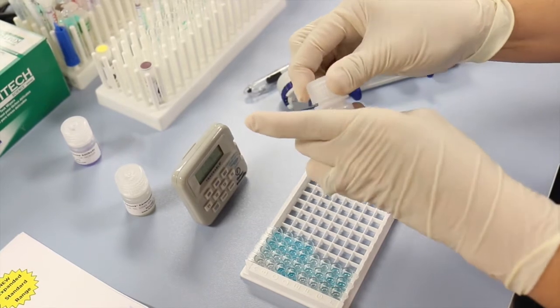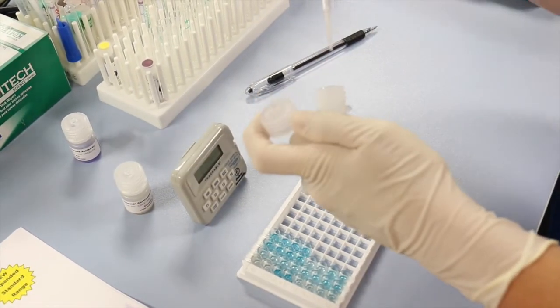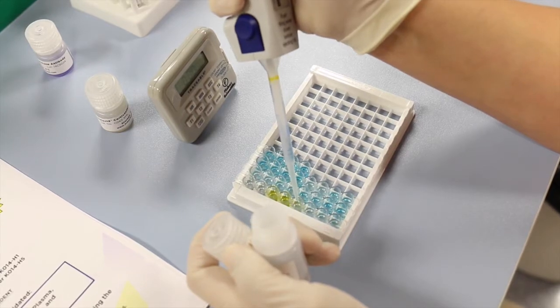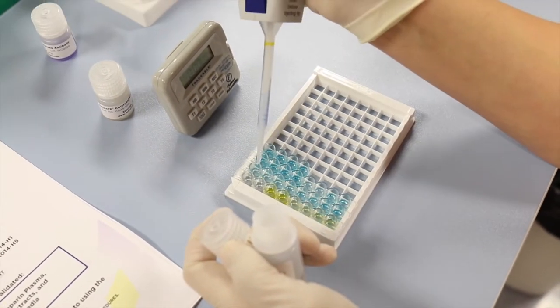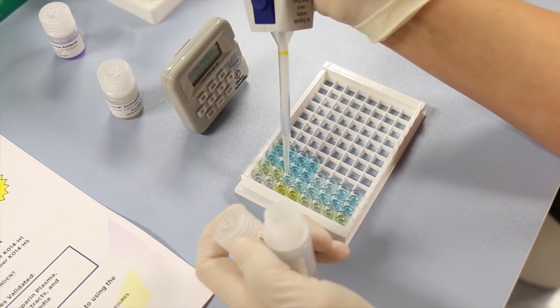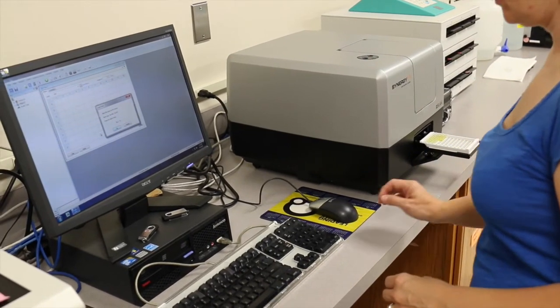At the end of 30 minutes, add the stop solution to each well using a repeater pipette with a tip designated for our stop solution. The wells will turn yellow. Read the plate at 450 nm immediately.